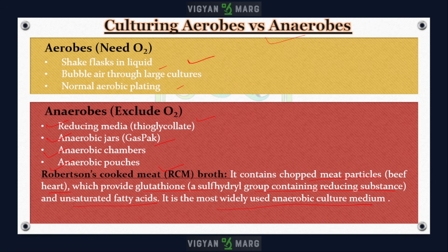The main concept from this is that culture conditions must match the organism's oxygen preference, and we have these methods to perform those experiments.